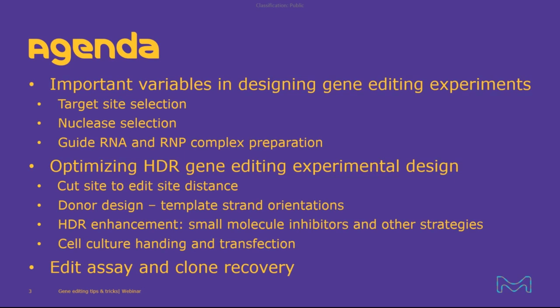And at the end, I will also provide some tips on editing analysis and single-cell cloning.